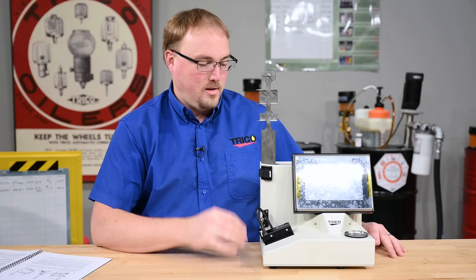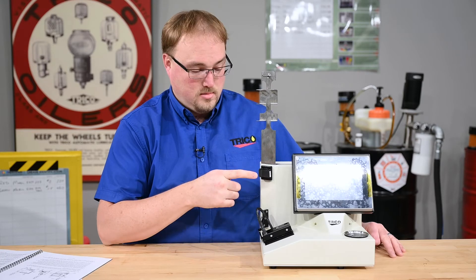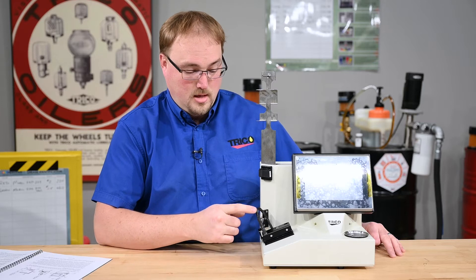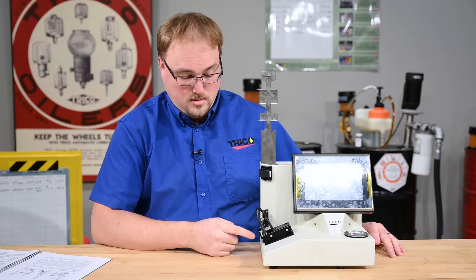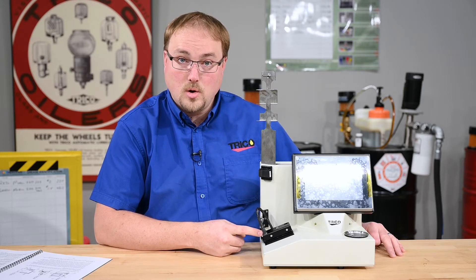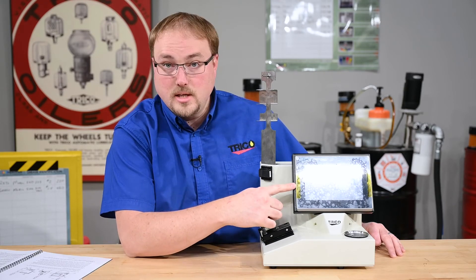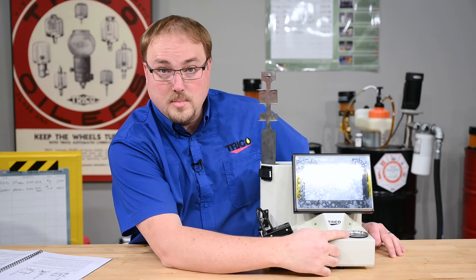Now on the front of the unit, we have the vial holder, the end of oil sensor, the tube holding assembly, the sensor cable, the optics assembly, and below the optics assembly is the magnet assembly. Then we have the LCD touchscreen and the waste beaker.